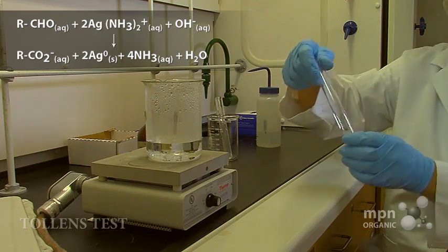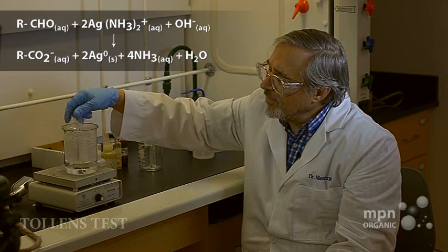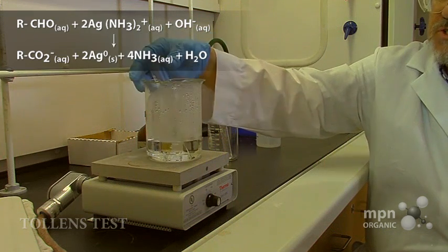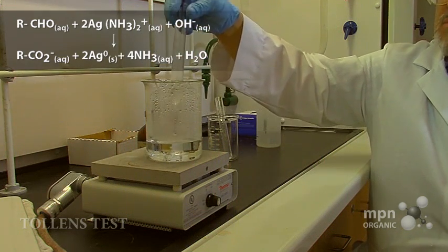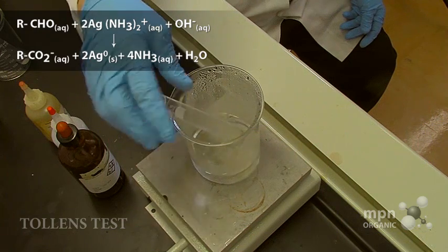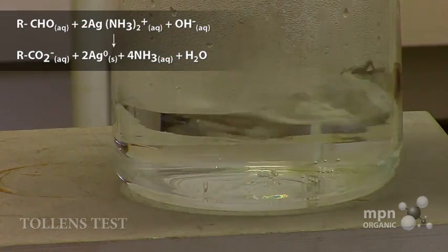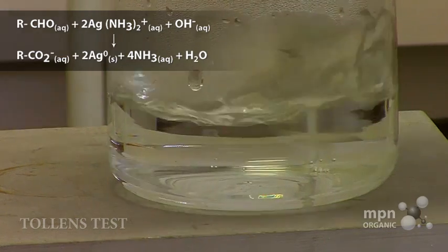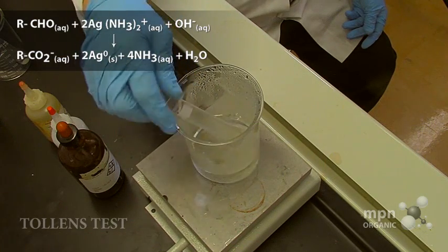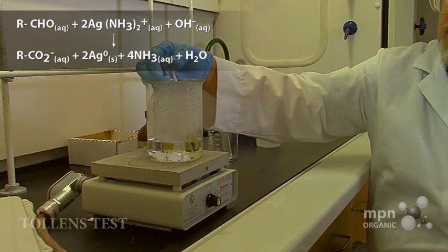Mix that up, and then we're going to heat it. The heating is the trick. You could leave this to its own devices, and it would eventually form what we describe as a silver mirror. But we're going to heat it up, and we should be able to get the silver mirror to form.